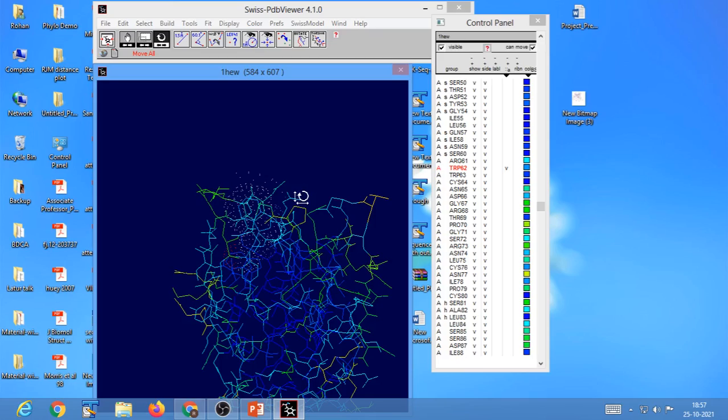Okay, so well, let me again define what is the exact difference between van der Waals surface and your solvent accessible surface area. Van der Waals surface usually lies at the distance of the van der Waals radius from the center of an atom directly above its surface. And this van der Waals surface includes the full surface of all selected atoms except where the surface overlaps.